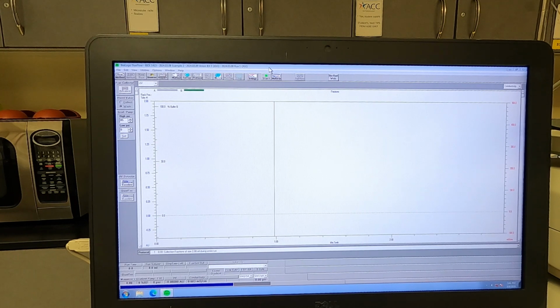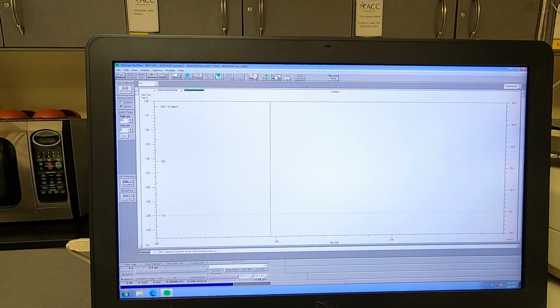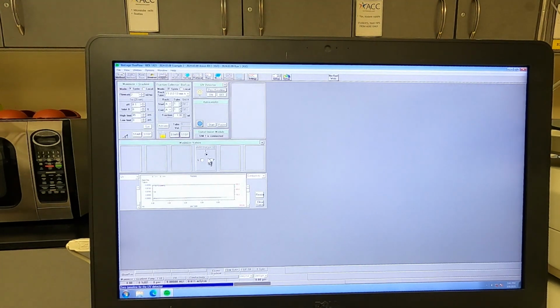Before we start this, what we want to do is actually load our sample onto the loop. Before we do that, let's go back to manual. So that window will stay there. If we return to run, it's still here. There's our green arrow. That was from run. But we're going to go back to the manual interface, and we want to make sure that our inject valve is in the load position.